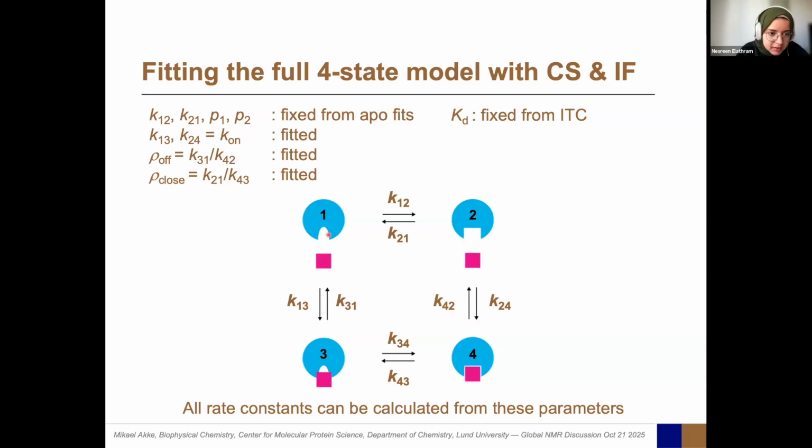Okay. Another caveat would be, for example, if there's a charge interaction, a Coulombic interaction, so the ligand is charged, the protein is charged. That's not the case for galectin. But if you have a case like that, and a conformational change in the protein changes the charge distribution, then that could actually also change the diffusion limited on rate. So the diffusion can be steered by electrostatic interactions to some extent. But again, that problem we don't have in this system.